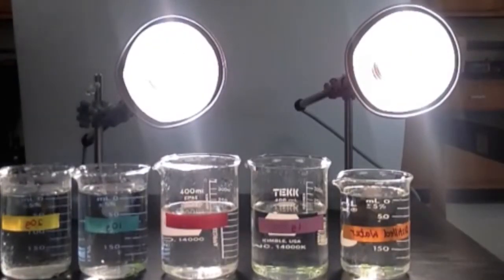Conclusions. According to our hypothesis, the number of floating discs should have been highest for the 20 gram solution. However, the data clearly shows that this hypothesis was wrong. The complete lack of floating discs in the control group suggests that some CO2 is necessary for photosynthesis. It seems, however, that too much baking soda can slow the process. The 1 gram solution showed the highest rate of photosynthesis.